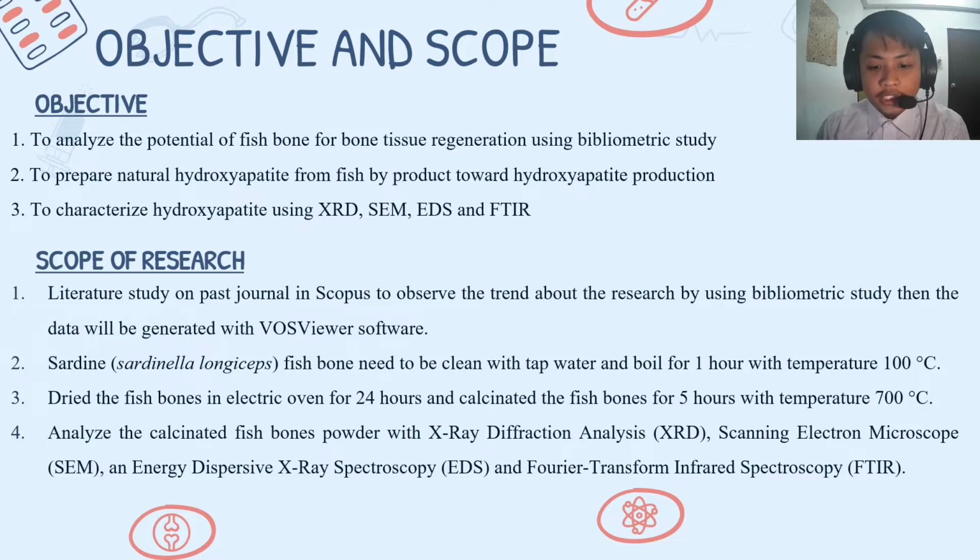And lastly, to analyze the calcinated fish bone powder with X-ray diffraction analysis (XRD), scanning electron microscope (SEM), energy dispersive X-ray spectroscopy (EDS), and lastly Fourier transform infrared spectroscopy (FTIR).